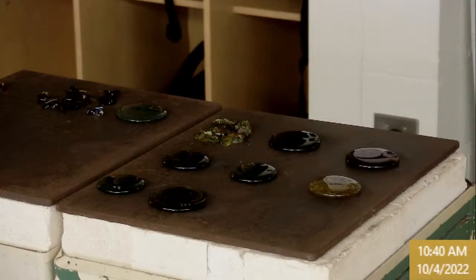Actually, what you're gonna do is, these are wooden paddles and they're to protect me from the heat. Okay. All right. Teamwork. You guys are awesome. So a couple things to watch here. What he's holding in his hand is a folded up piece of wet newspaper. Surprisingly, wet newspaper allows you to smooth and shape glass, and it boils off and steams away water, and it actually protects you on the other side of just that inch pad of wet newspaper. But the radiant heat, like what we felt here, is hitting any flat surface parallel to the glass, so his chin is about to get burnt off here, and they're basically just casting a shadow with this paddle for the heat.